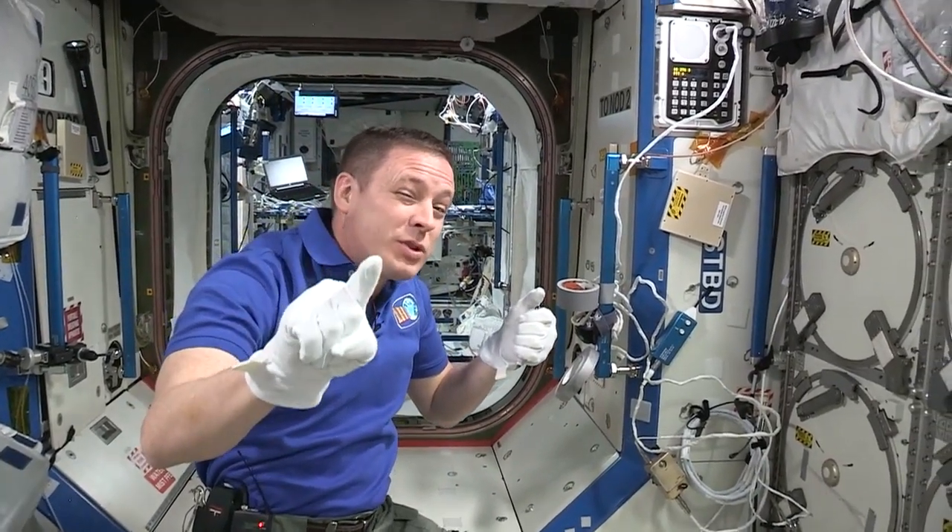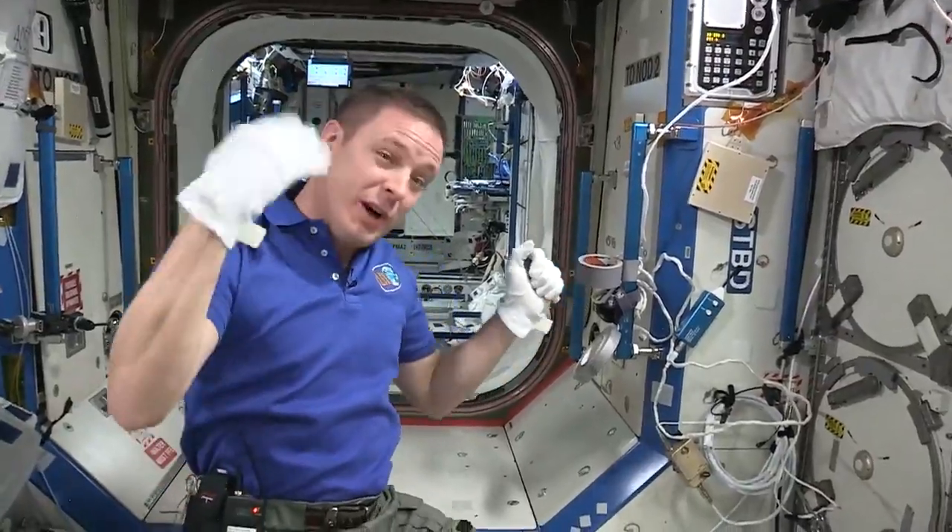I actually have a sample that I have to put in one — to make it more dramatic and awesome, we've turned out the lights and we have backlighting so it'll just look cool. Come on, let's check it out.